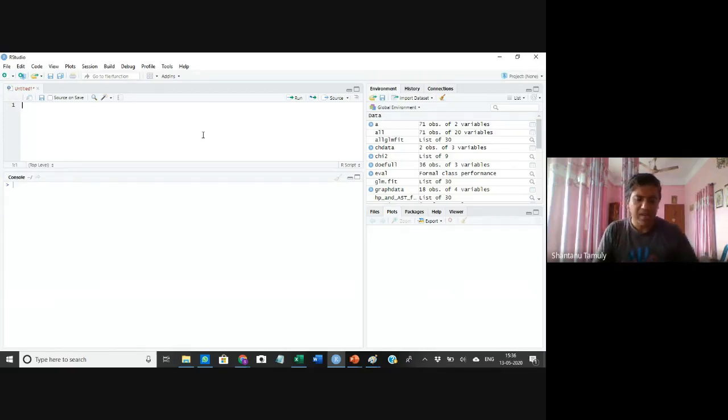So now let us say that we have two variables. One is the molecular weight and another one is the distance traveled. I will call the molecular weight M. Let me write it as capital M is equal to, now I put a small c and a bracket. Now I'll start putting the values over here.